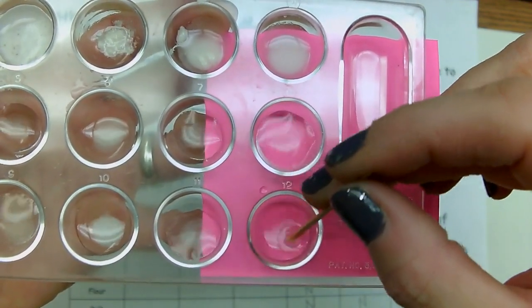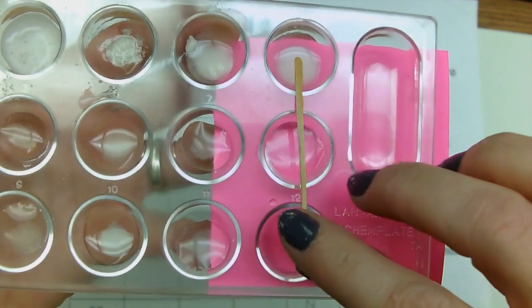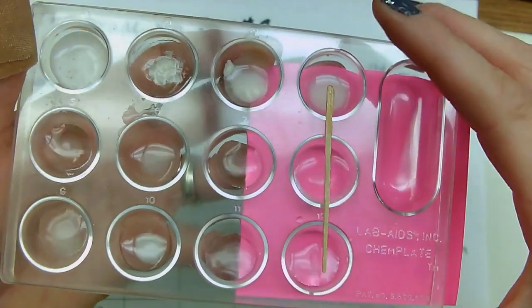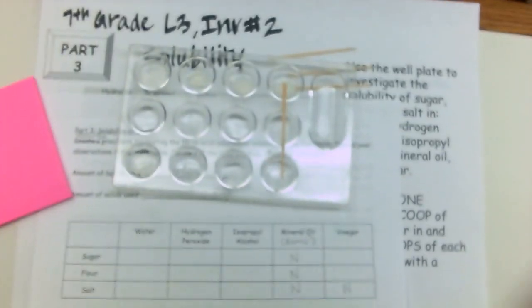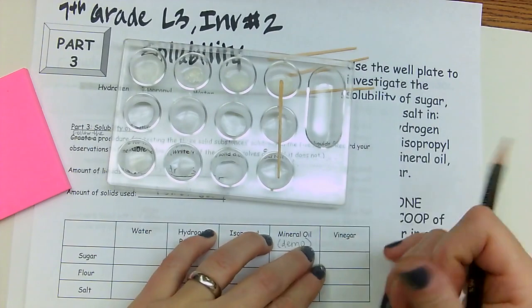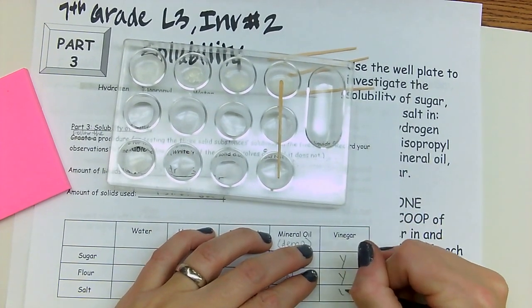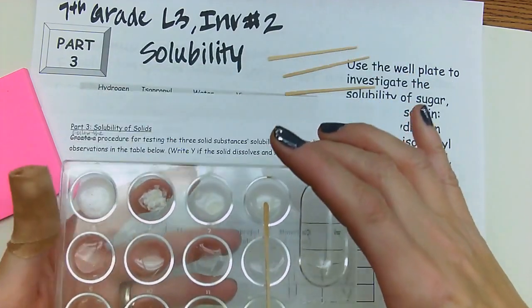Okay, I'm going back on my answer. Let's go back on our answer, which can totally happen. Okay, so let's look at our answer. Let's change it. This is why I do labs in pencil. So I'm going to say vinegar: yes. All three dissolved.